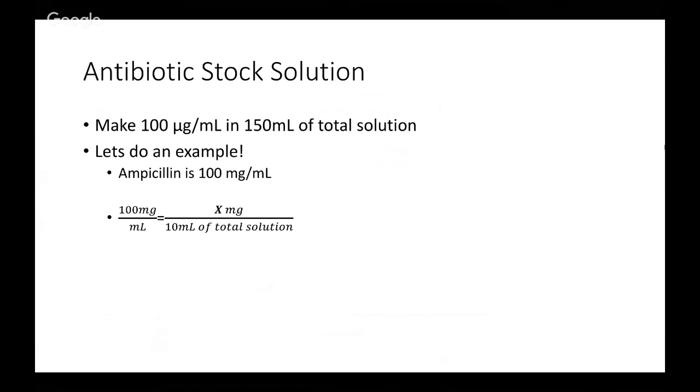So I would just take smaller volumes of it. Some laboratories that I know make a really big stock and then aliquot it into those little tiny 1.5 milliliter tubes that we sent you in bulk as well.